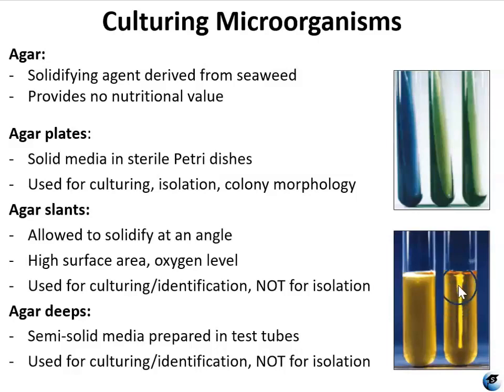And because of the way that you inoculate these, you can actually test your microbe for motility. That is, you can observe whether or not the bacteria or the microbes were able to move away from the inoculation point in order to access either more oxygen or more nutrients or whatever. In other words, you can use a deep to see if your specimen have flagella or cilia or some other mechanism for movement.